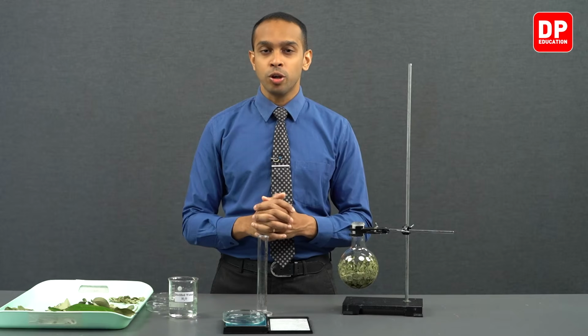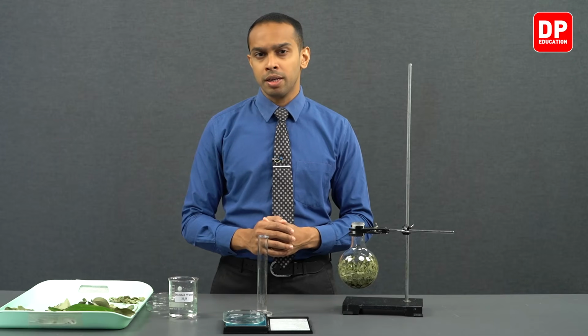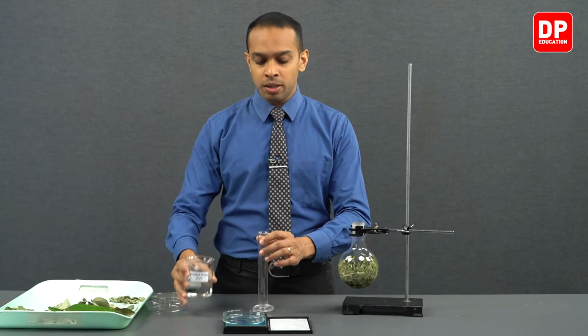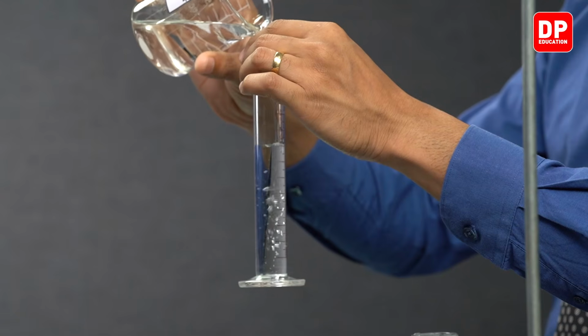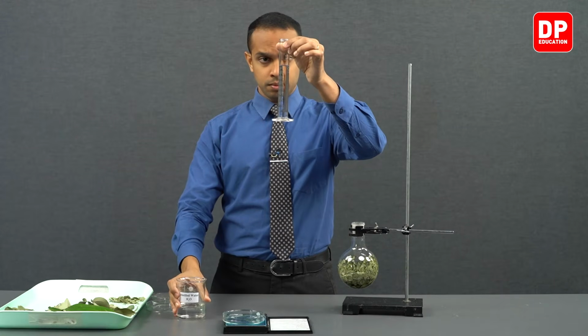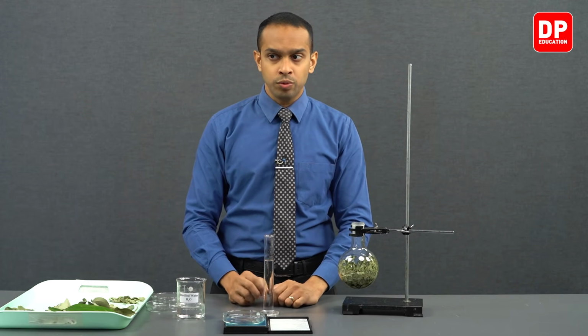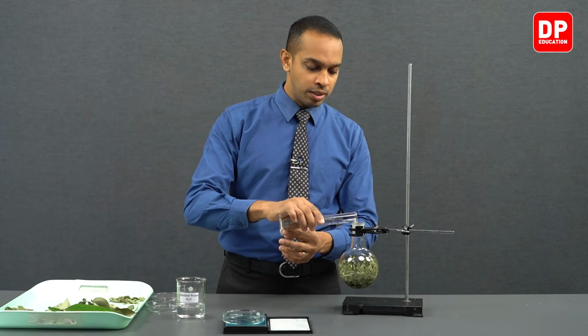So students, as you saw, we transferred 50 milliliters of water into this round bottom flask. But if you remember correctly, we used 10 grams of cinnamon leaves. So therefore, we should be using 100 milliliters of water. We have already transferred 50 milliliters of water into this round bottom flask. We should measure another 50 milliliters of water. We have measured another 50 milliliters of water here, and we will be transferring this 50 milliliters of water also into our round bottom flask here.